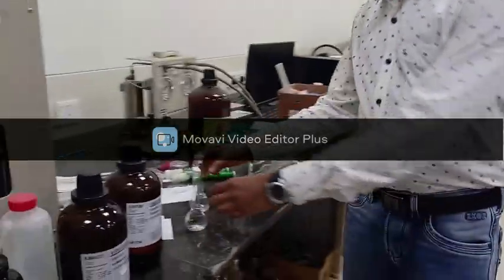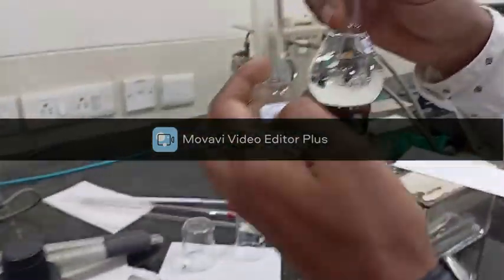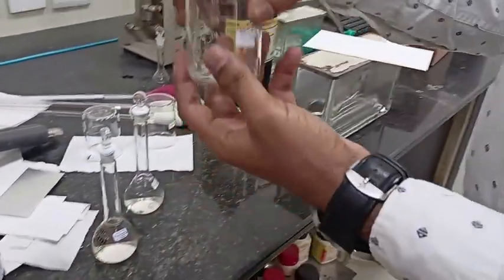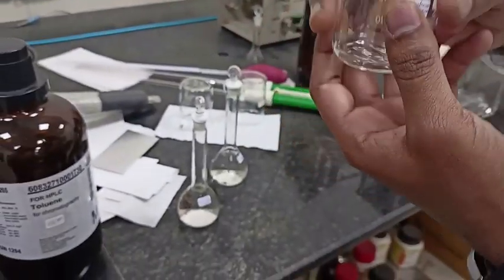I am going to show the experimental apparatus and the chemicals and reagents used for this HPTLC experiment. First we have to prepare the two standard solutions of benzophenone and benzhydrol. Then we will prepare a mixture of unknown concentration from benzophenone and benzhydrol.